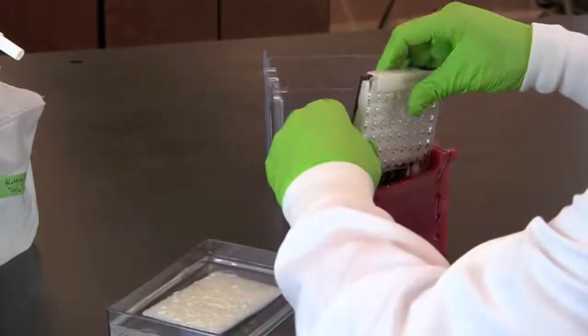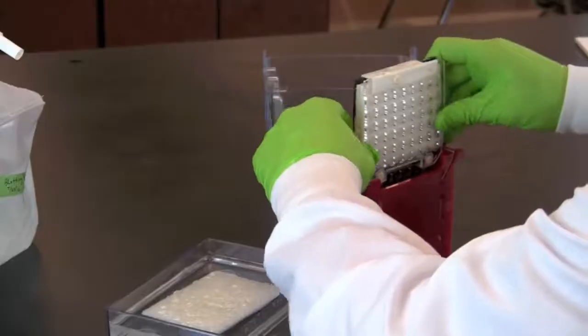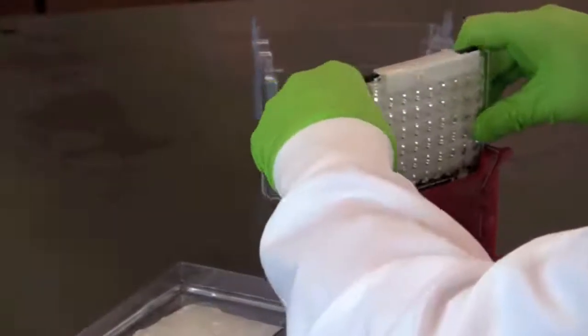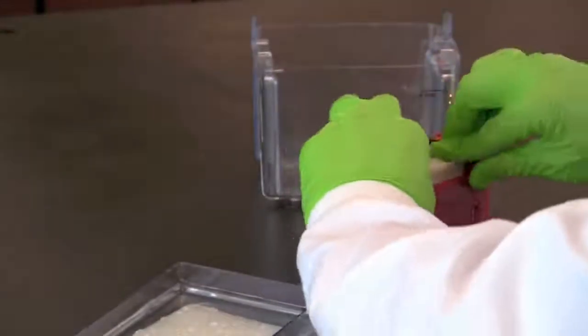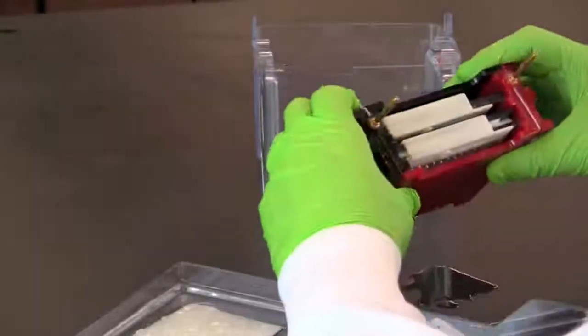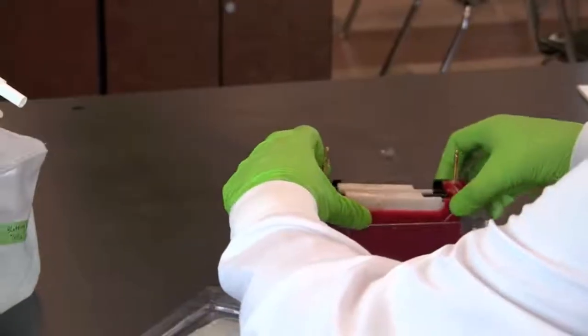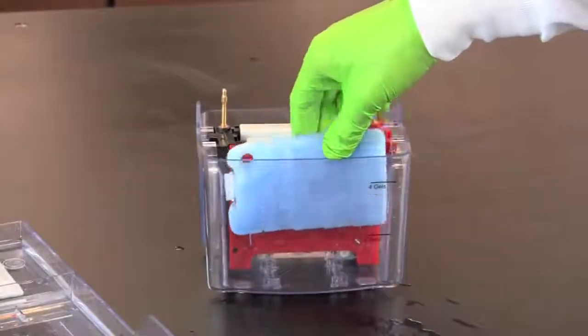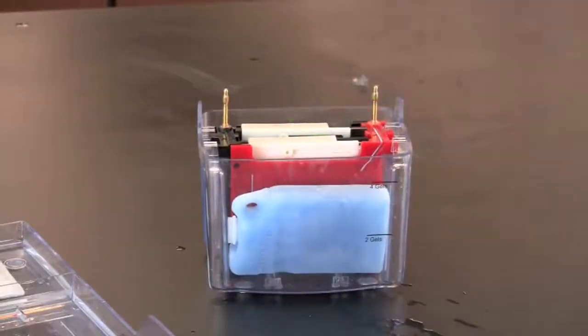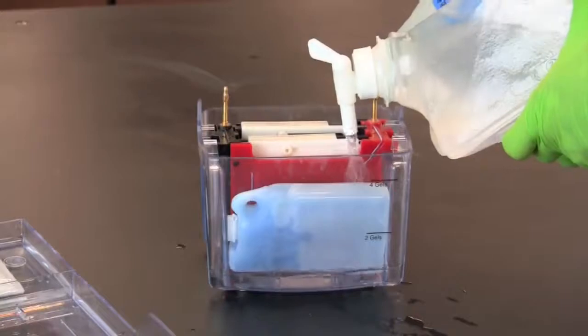Insert the gel holder into the inner module. Make certain that the black side of the gel holder is next to the black side of the module. Place the inner module into the electrophoresis chamber. Add a frozen cooling unit and fill the chamber with blotting buffer to the level of the white clip on the gel holder.